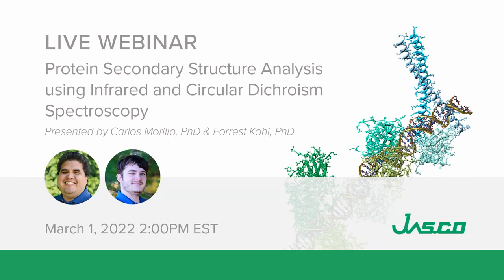Today we've got the first of our webinars this year, and it's part of a series that we'll be doing throughout the year. And in this particular webinar, we've got our two application specialists in vibrational and electronic spectroscopy, and they're going to be introducing both the use of IR spectroscopy and circular dichroism for protein structural analysis.